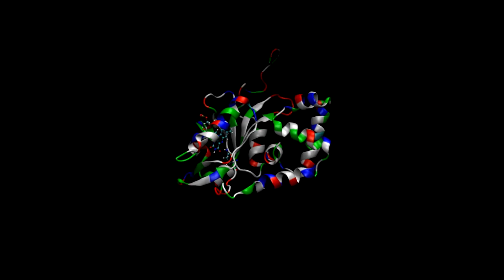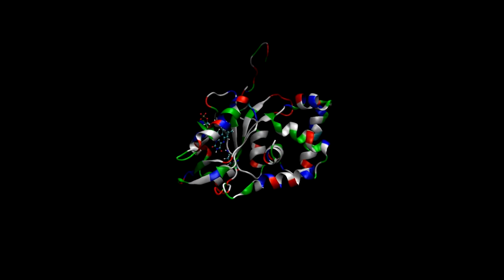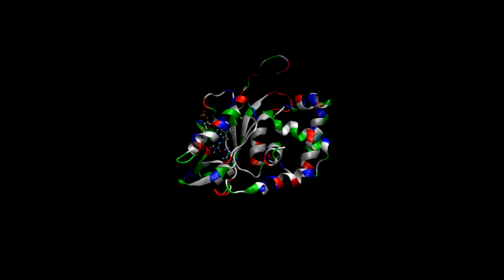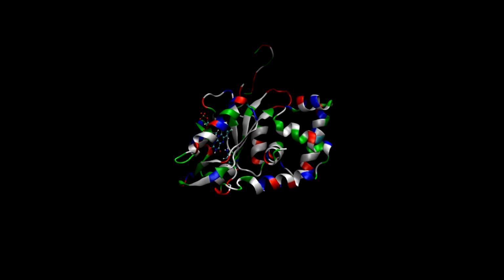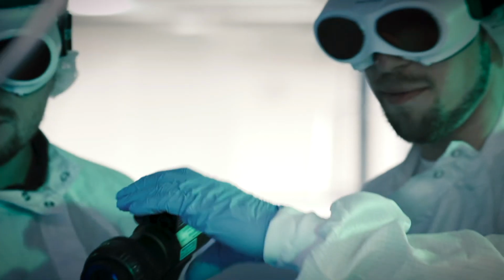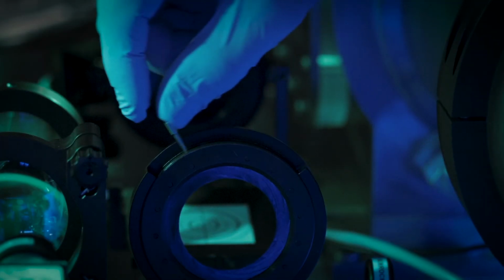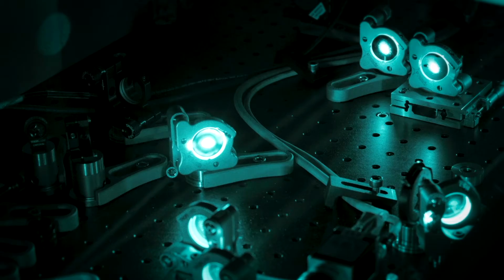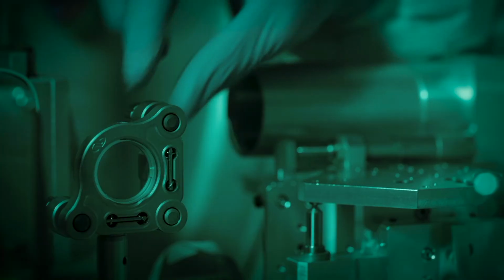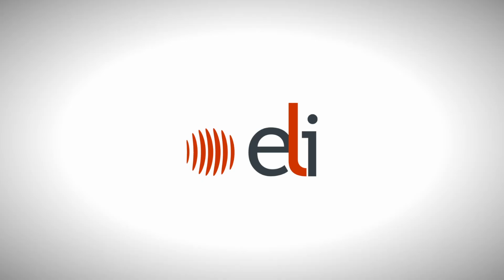And last but not least, we study dynamic, time-variable aspects of interactions between proteins and DNA. In our laboratory, we devote great attention to this research. Thanks to our collaboration with the Institute of Physics of the CAS, the ELI Beamlines Laser Facility, we can study the dynamics and interactions of potentially technologically interesting transcription factors, meaning proteins controlling the synthesis of other proteins in cells.